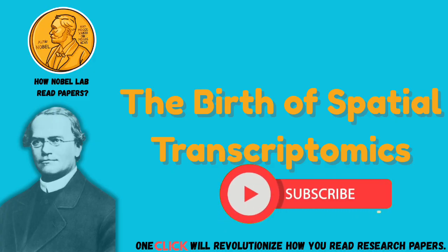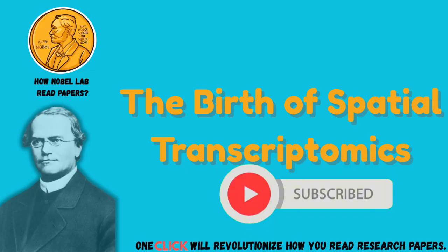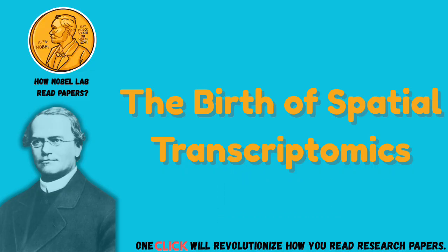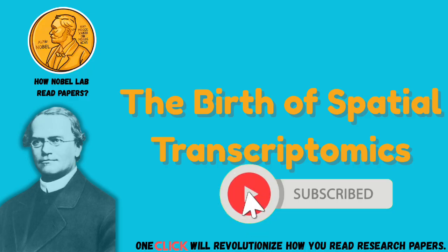But that raises the big question then. It's great for mapping clean layers. But what happens when you throw this completely unbiased method at something really complex and messy? Like a human tumor biopsy. Exactly. What kind of hidden patterns could you find that the old averaging methods would just completely miss? And that is the climax of the paper in Figure 4. They applied it to human breast cancer. They didn't go in looking for specific genes. They just used machine learning, t-SNE, to let the data cluster itself.